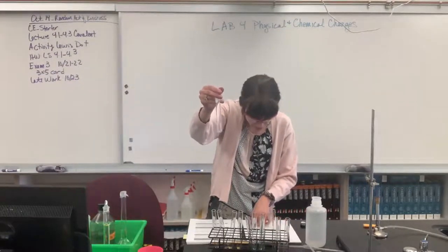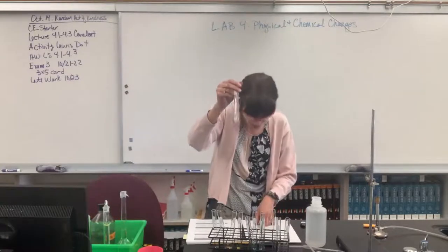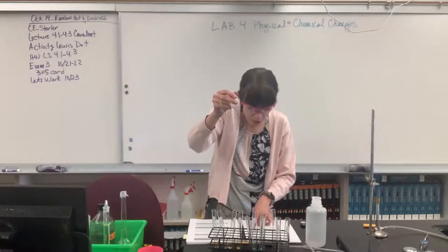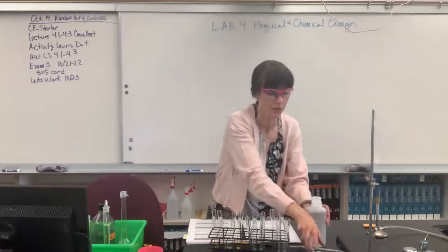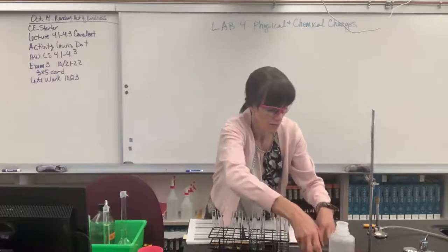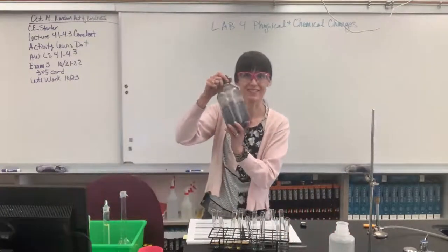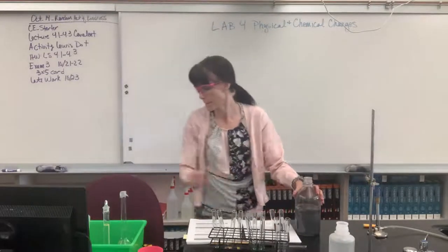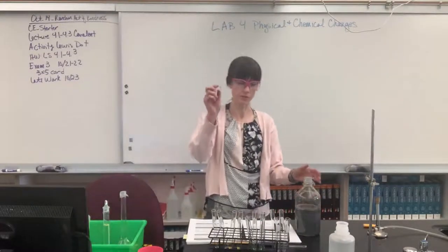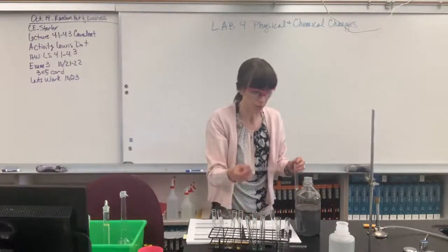So we add the distilled water. Now it says add more water drops if needed. No, it's dissolved. We're good to go. Now it says to add 2 drops of silver nitrate. Okay, so I'm going to put this down. I'm going to set my water off to the side with its dropper and I'm going to get the silver nitrate. This is silver nitrate. Okay, here's our silver nitrate. I'm going to get a dropper for this. So here's a dropper for silver nitrate, and it says two drops.